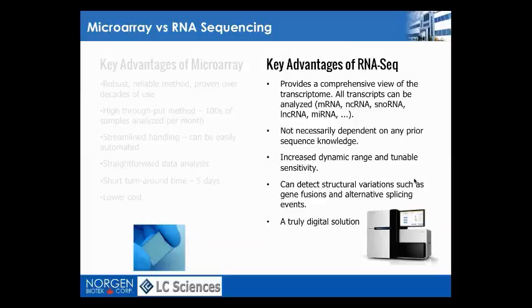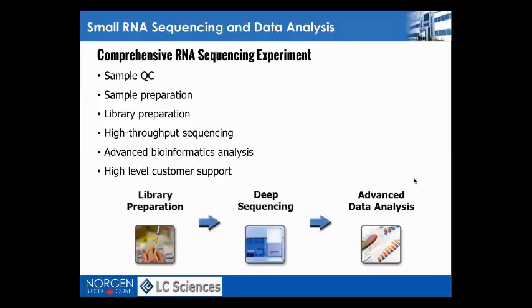As mentioned, RNA-seq kind of took over at least the discovery step, but a lot of customers use it also for the profiling step. It really depends also on your budget, quite frankly. So let's focus on this for now.